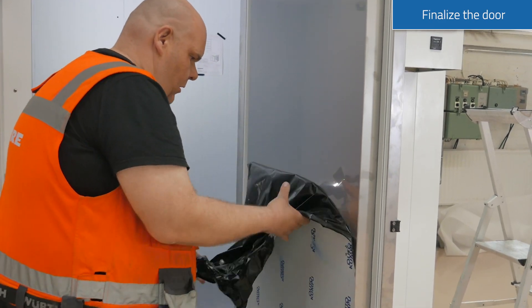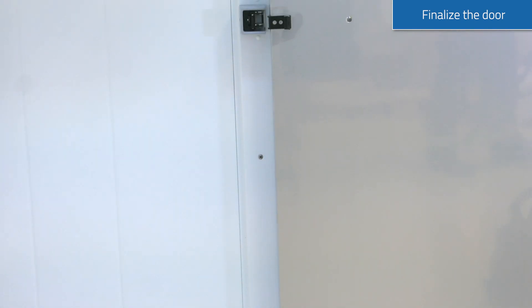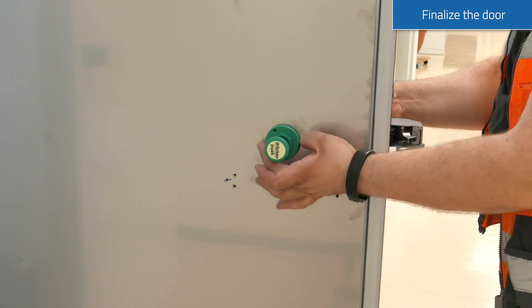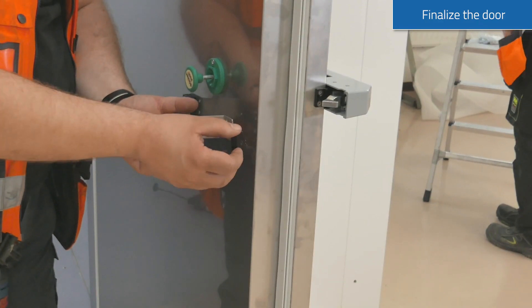Remove the protective tape before installing door handles. Place the handle and lock on the outer part of the door. On the inside of the door, attach the safety lock and metallic handles in their places.